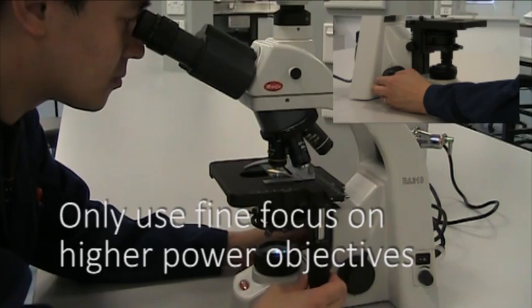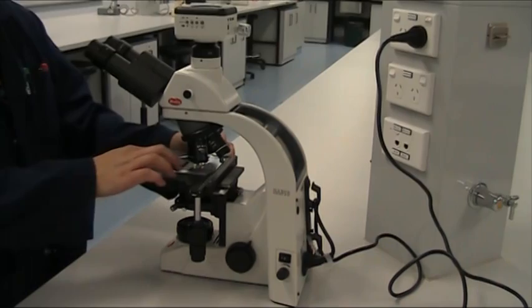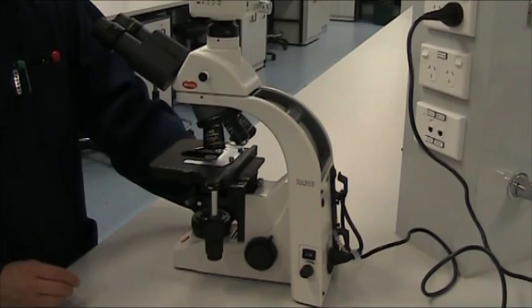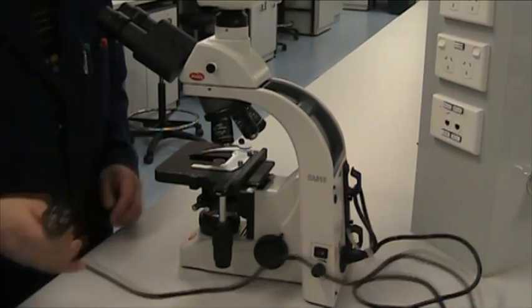When you are done with the microscope, remove your slide, switch the microscope off, swing the lowest power objective into place and lower the stage. Wrap up the power cable and using both hands, place the microscope back into a dust proof storage area.